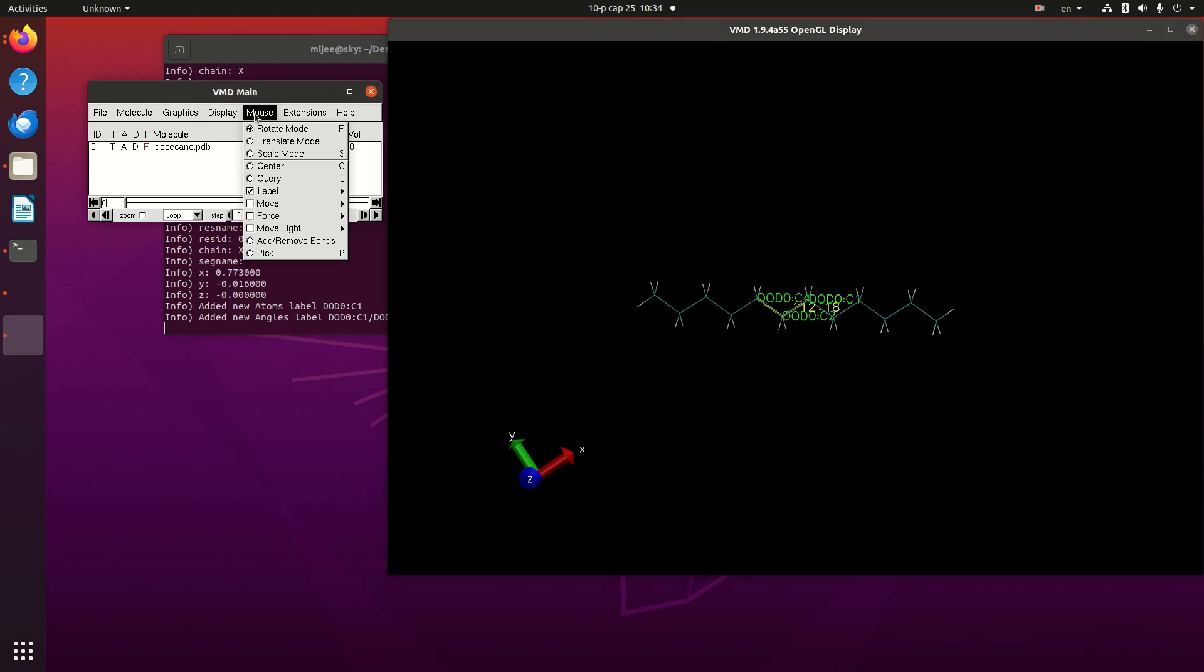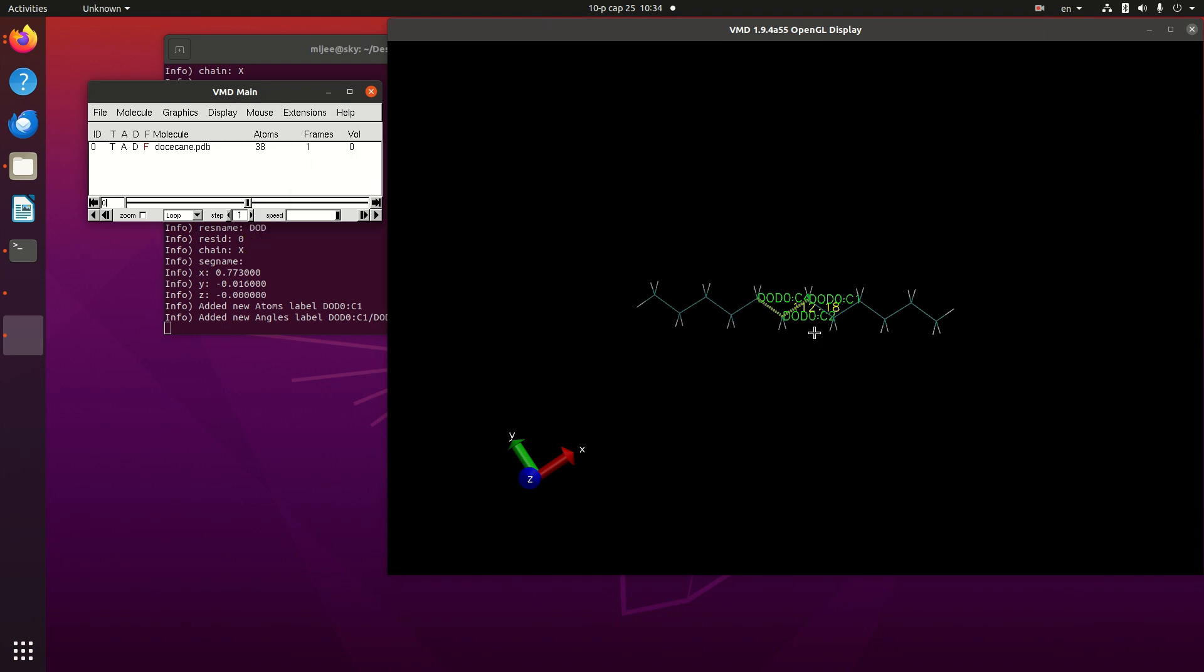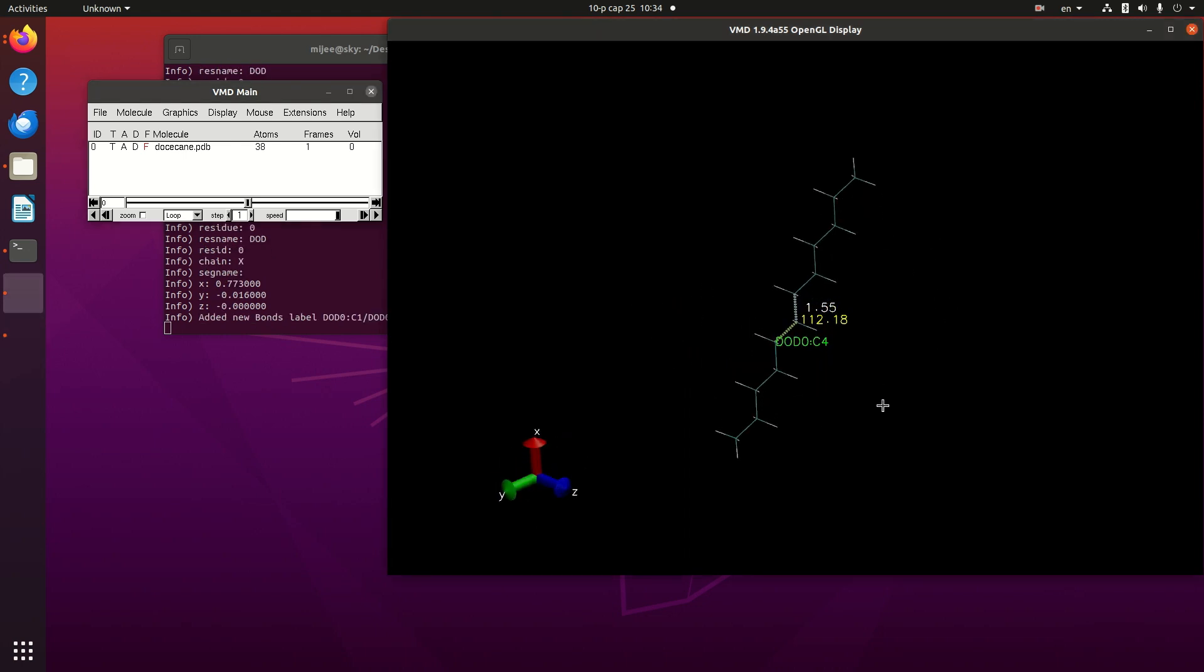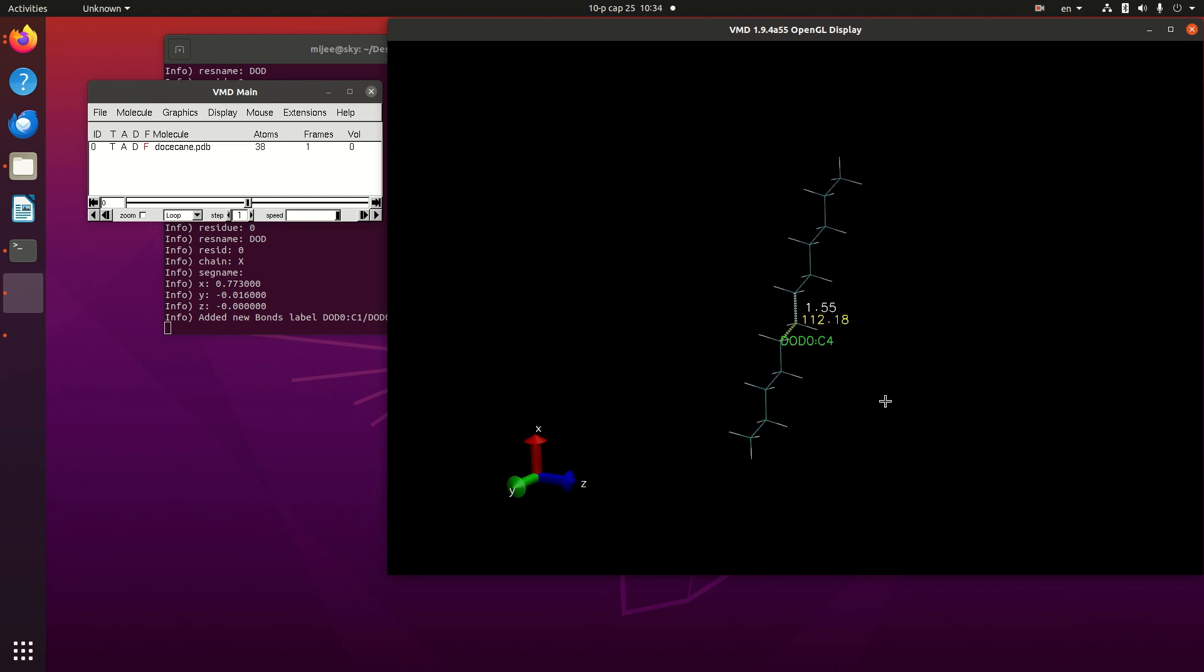In order to do this, I would like to label another bond. One, two. This bond value is 1.55 angstrom.